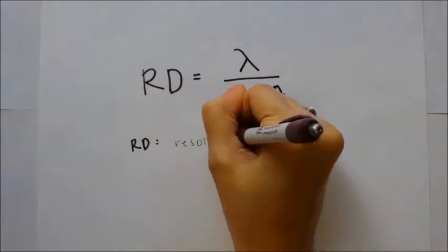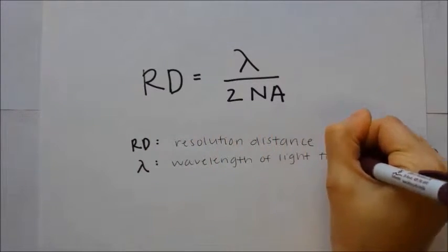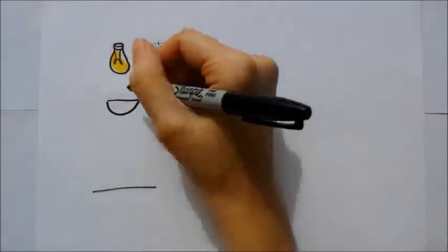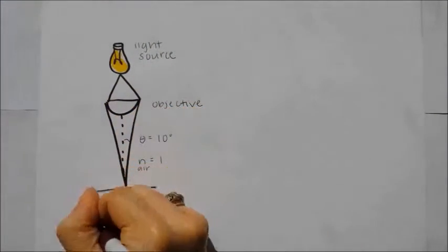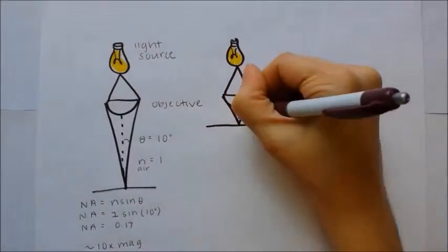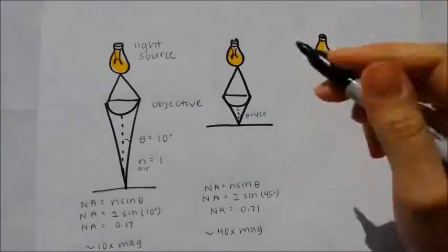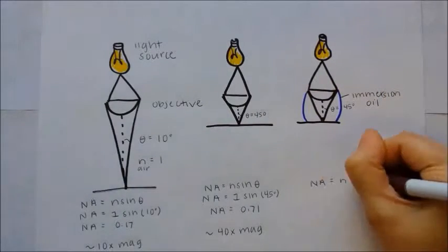The numerical aperture is ultimately the field of view of the lens, but more specifically is the measure of the number of highly diffracted image-forming light rays captured by the objective. Numerical aperture is dependent on the angular aperture, which is the maximum angle of image-forming light rays diffracted by the sample that the front lens can capture when the sample is focused, or the angle between the microscope's optical axis and the direction of the most oblique light rays. It is common to decrease the focal length or use an immersion medium such as water, glycerin, or immersion oil to increase the numerical aperture, which will in turn generate a more highly resolved image.